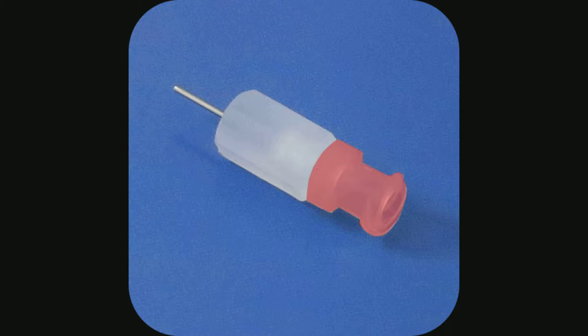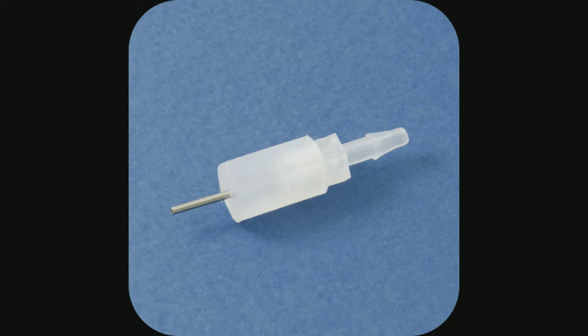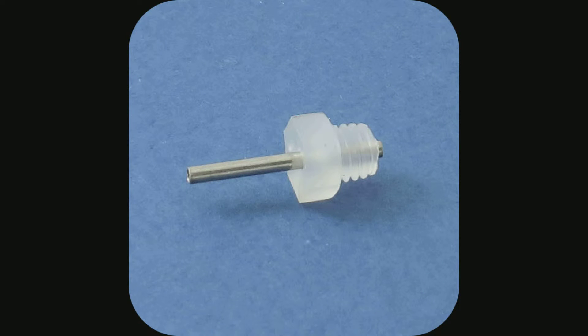They accommodate the range of microboard tubing from 10 thousandths to 50 thousandths inside diameter. The lure fittings are available in both male and female lure. The barb fittings are available in 1/16th inch, 3/32nd inch, or 1/8th inch. The threaded adapters are available in 10-32.